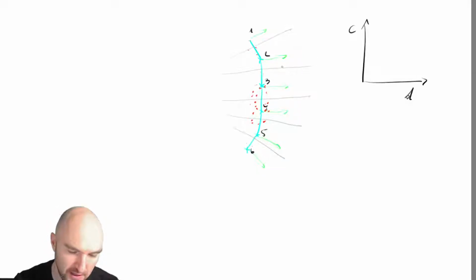Explicit one would mean we calculate geometrically what the Voronoi cells are, and then do a containment test to calculate which atoms are inside the Voronoi cell and which ones are not. You can do that, but that's computationally fairly expensive. The much simpler way is the implicit one, by just saying, okay, this atom is closer to this vertex than to any other vertex.